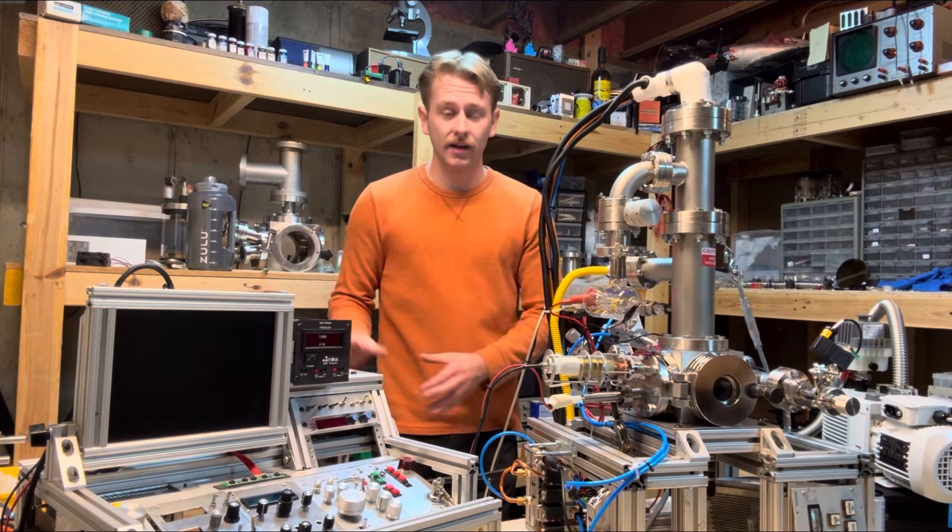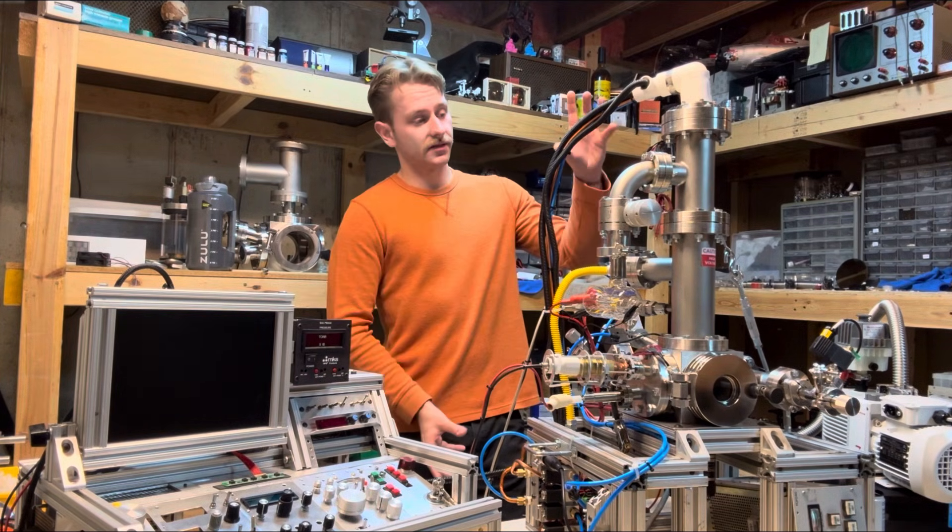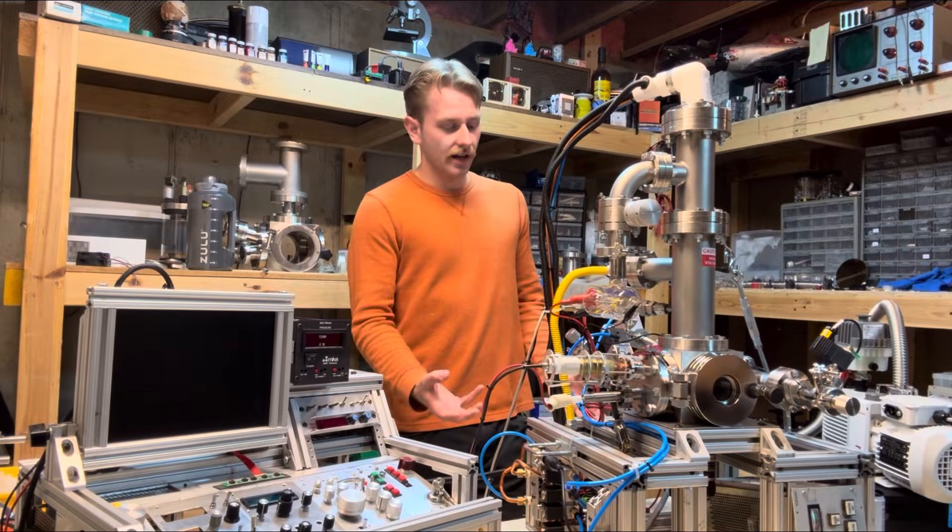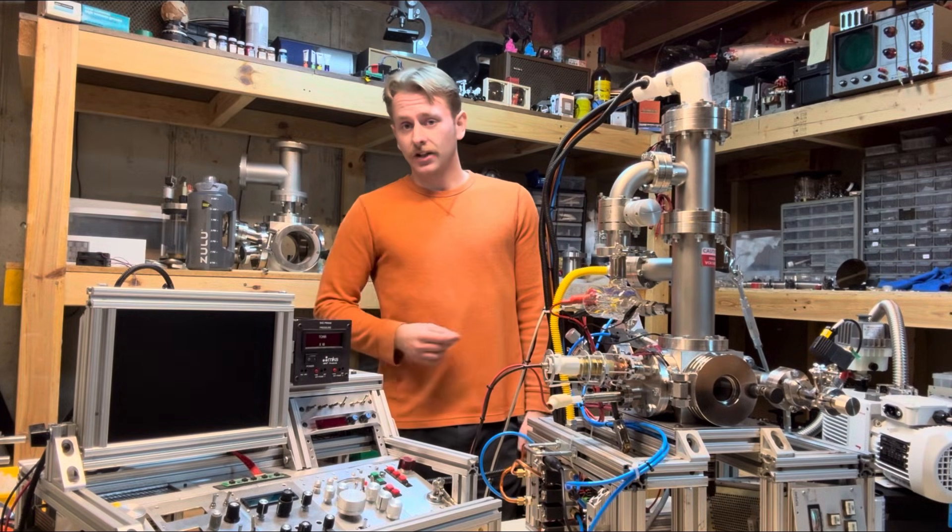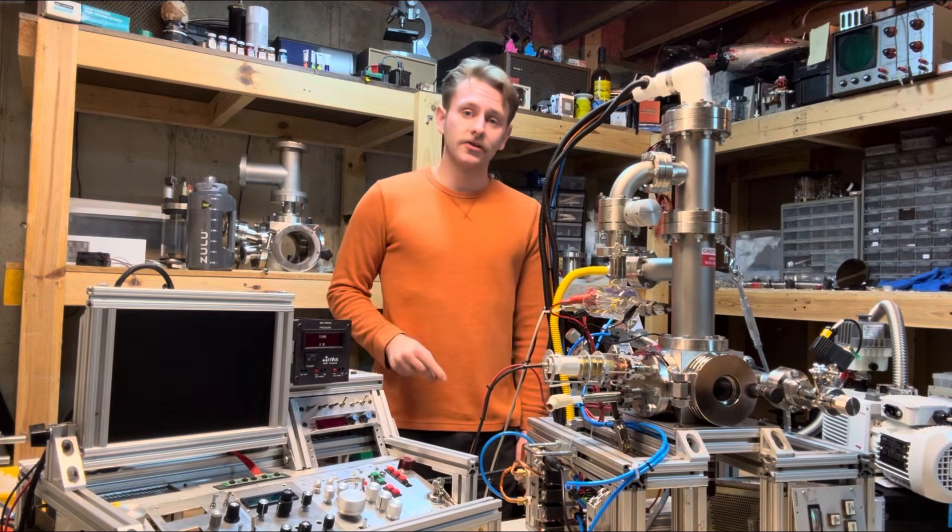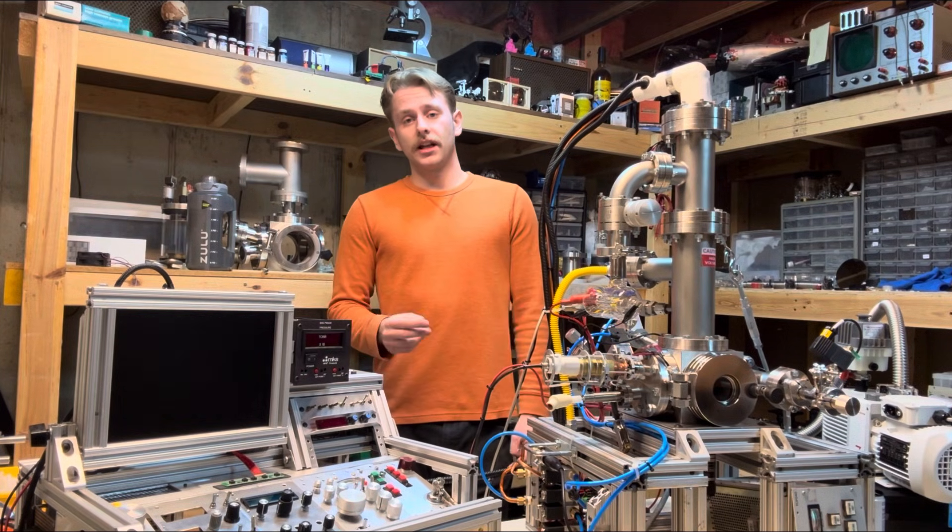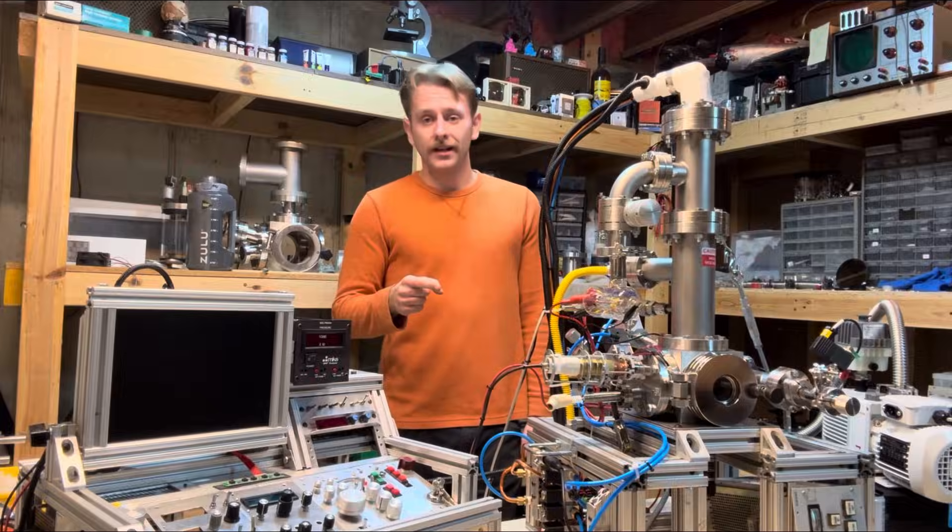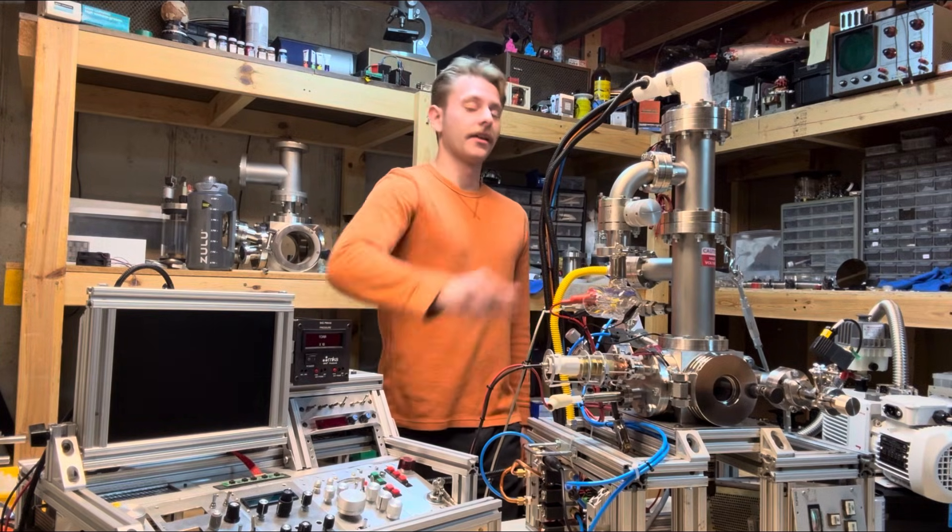So this is the mainframe and this is the actual microscope. This is basically a vacuum chamber with a chassis. You need a vacuum chamber for an electron microscope because we're using, instead of light, we're using electrons. We're using a beam of electrons and those electrons don't want to bump into anything. So we effectively need nothing in the way.